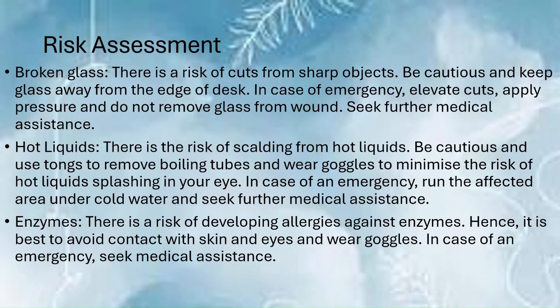You also have the risk of enzymes, there are chances of developing allergies. Hence, it is best to avoid contact with skin and eyes by wearing goggles. In case of an emergency, seek medical assistance.